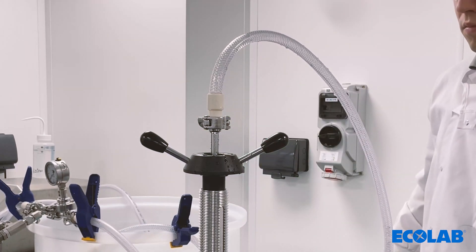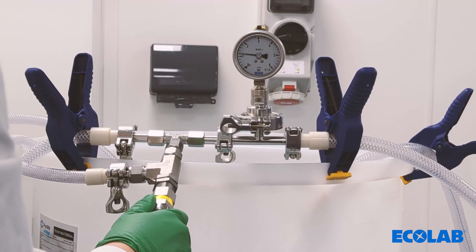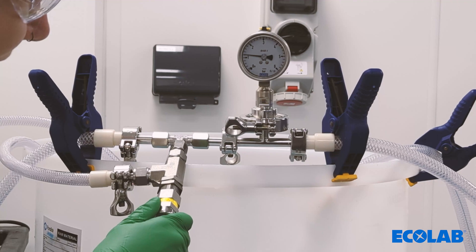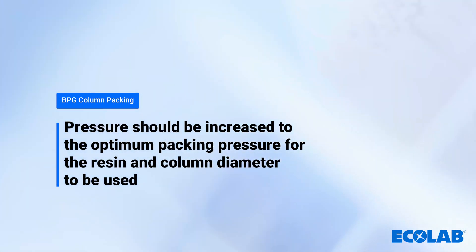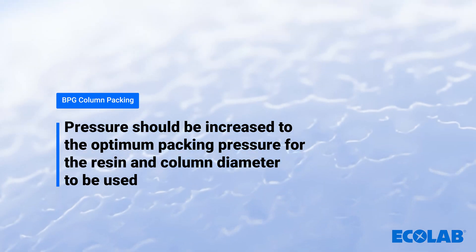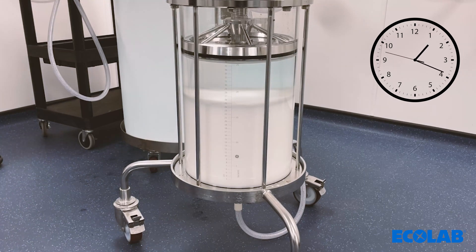The next stage of the packing process is to increase the pressure applied to the column. This can be completed by setting the relief valve at the packing pressure or adjusting the relief valve to increase the pressure to the desired packing pressure. The pressure should be increased to the optimum packing pressure for the resin and column diameter, which can be found in the resin information. For this example packing of DuraCycle A50, the packing pressure in a 30 centimetre ID column is 2.2 bar. Once the packing pressure is reached, allow the bed to stabilize at this pressure for 20 to 30 minutes.